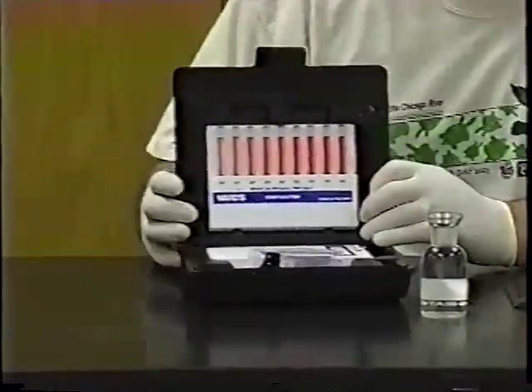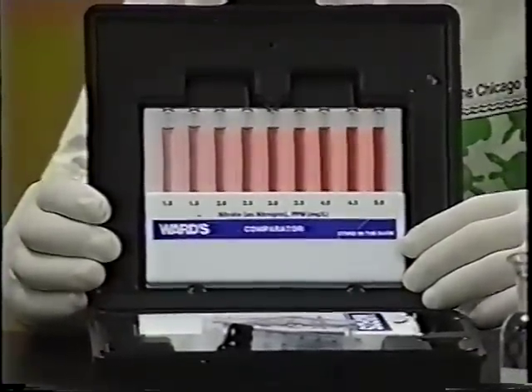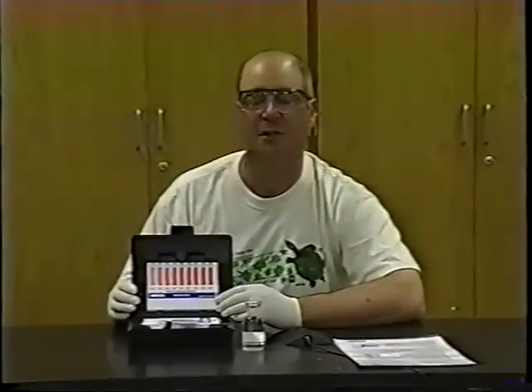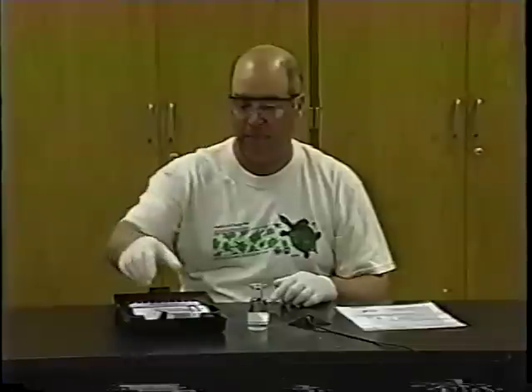One thing you'll notice is that this is a fragile experiment. It's fragile in the sense that there are glass ampules in the kit — little tiny vials that contain specific chemicals needed to run the test. This used to be a very difficult test, but Ward Scientific Supply Company has provided us with an easier form. These test kits have been designed so that the chemicals are pre-mixed. You'll collect your data and be able to start analyzing it when you get back to class. You just begin by following through the procedure.